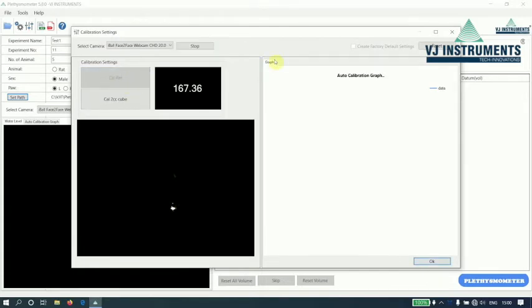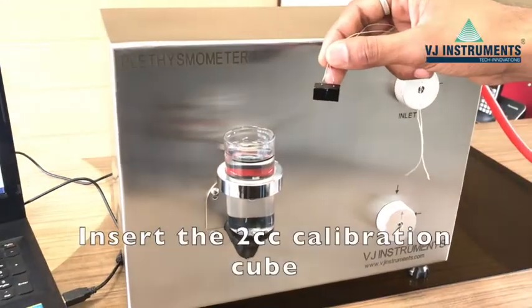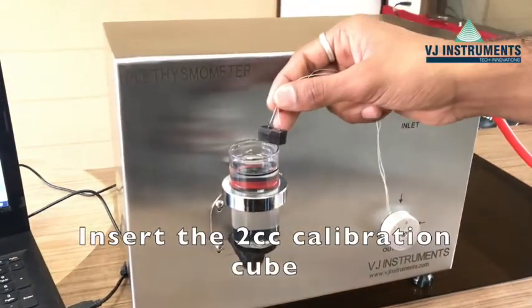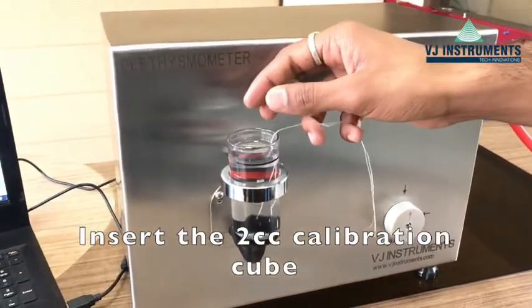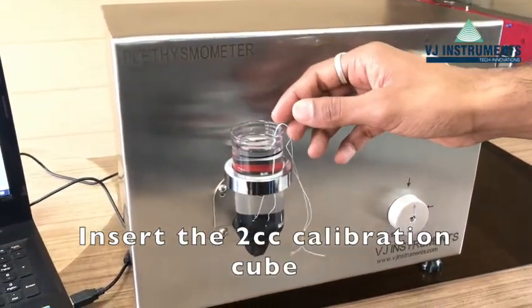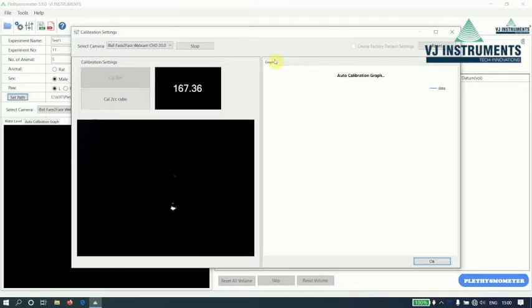The cubes are provided by VJIT instruments. Let us now insert 2CC cube. Once we insert the cube, the readings will be automatically locked after 10 seconds.